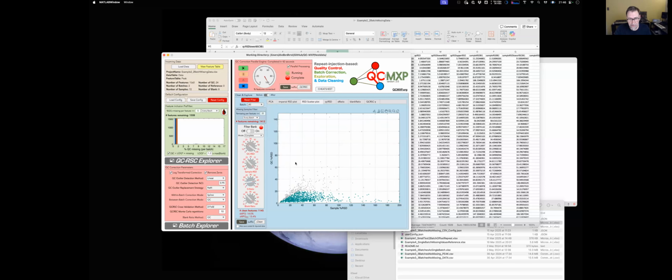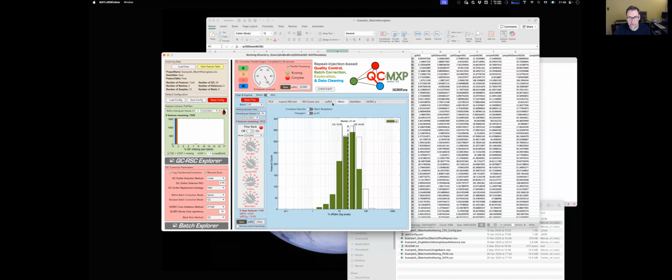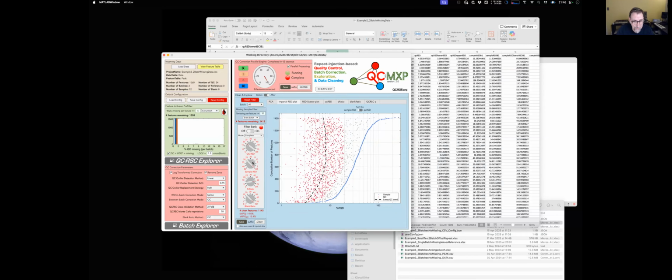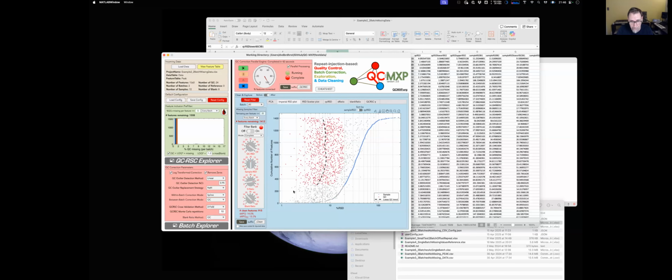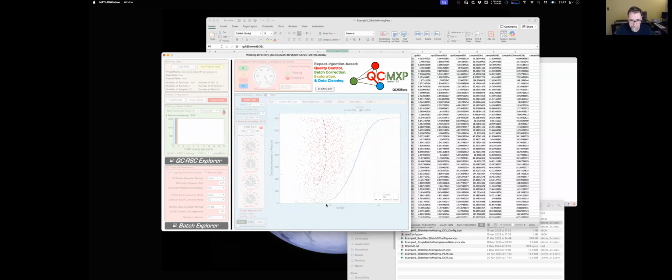You can do this in a scatter plot like I presented in my talk, and then we've got histograms of each of those as well, and we can break it down by batch, particularly useful if you're doing a lot of batches. Quickly now, I can just quickly go through the filter bank. As I just said, you can filter out data based on the RSD. You could also just base it on the sample RSD, and you can see we're now going to cut off the bottom of those points. So now we've got a neat square of really nice data. I generally don't use a sample RSD filter, but you can. It really means that you don't have to bother using the D ratio.